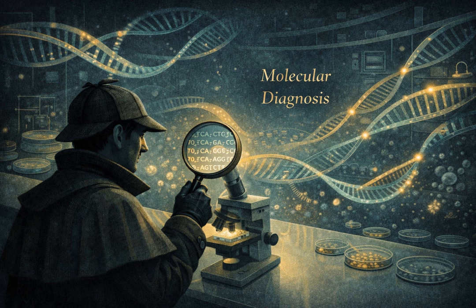Real-time PCR gets rid of all that. It measures the amplification as it happens in real time. Wow. You add fluorescent dyes or probes into the reaction tube from the very beginning. Every time a new copy of DNA is made, it generates a little burst of fluorescence. The machine has a detector that watches the amount of fluorescence increase with every single cycle. So you can literally watch the curve of the signal go up on a screen.